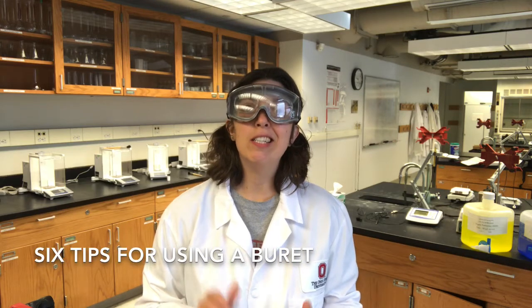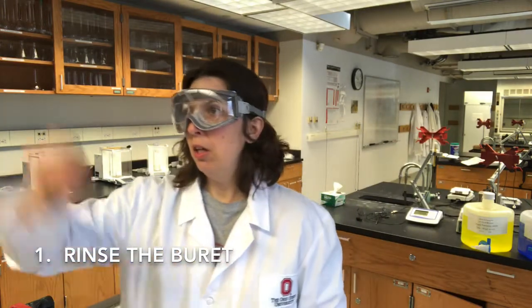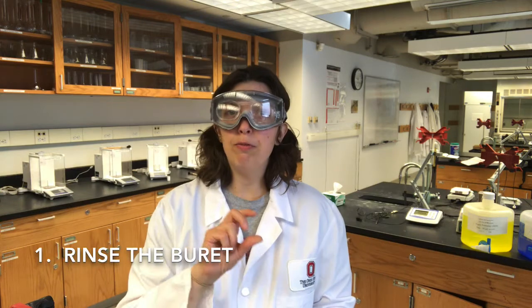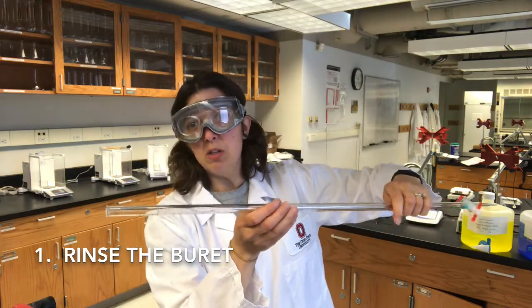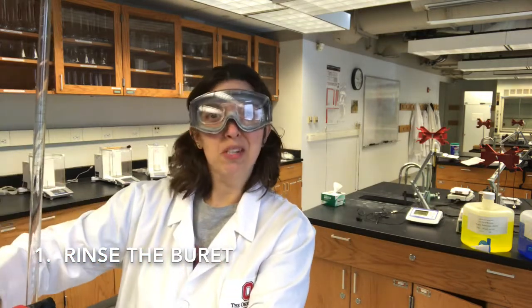Alright, so let's go over six tips for using a burette properly. Number one: rinse the burette with the solution that you're going to be putting in and using in the burette. So if you're doing a titration with sodium hydroxide, rinse that burette a few times with small amounts of sodium hydroxide. You can put a little bit in the burette itself, pour that into a waste container, and then do that a couple more times.